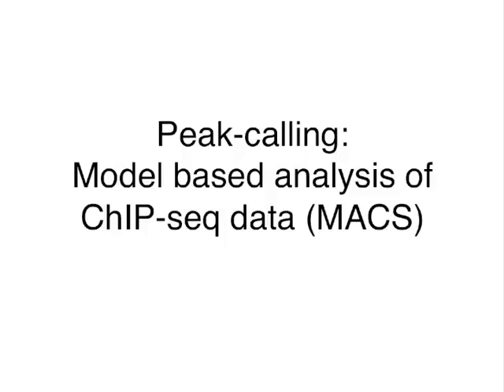Okay, welcome to video 2 of the ChIP-seq day. What we're going to be talking about now is the model-based analysis of ChIP-seq data, or a program called MACS, which does peak calling.